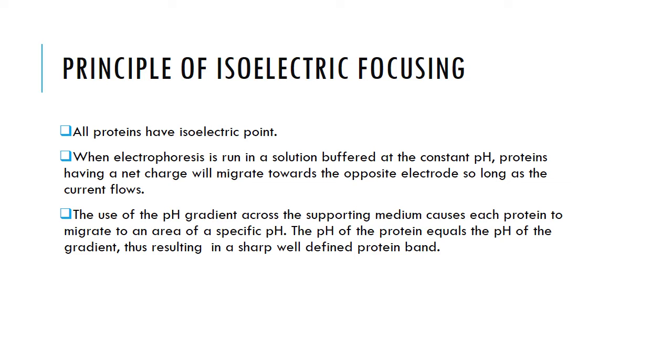We are trying to say that if we take a mixture of proteins and put it in a supporting medium with a pH gradient across it, we are expecting the proteins to be moving.